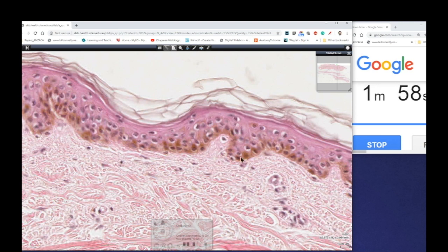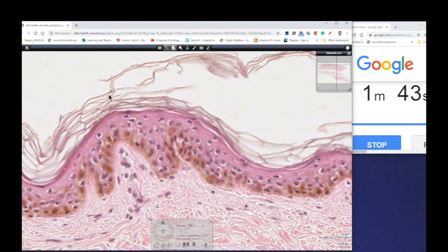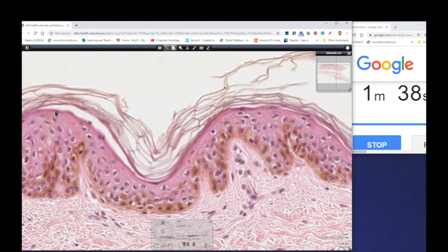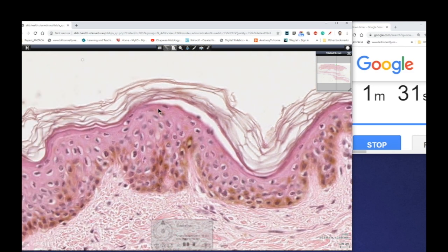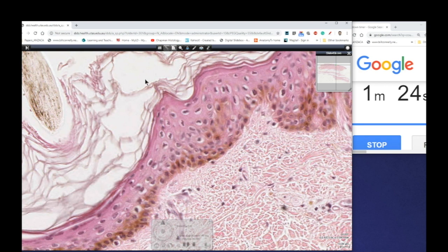So they begin as these basal cells. They undergo mitosis. One of those cells moves up into the next layer, and then eventually they migrate their way to the surface, eventually accumulating these granules which eventually fuse together at cell death to form these dead cell layers. You can see there's no nuclei present here. Once the cells are in this layer here, which is known as the stratum granulosum of the epidermis, they actually undergo cell death. All the organelles break down, the nucleus breaks down, and so these layers are actually basically cell membranes filled with that protein keratin that eventually gets shed on the surface here.